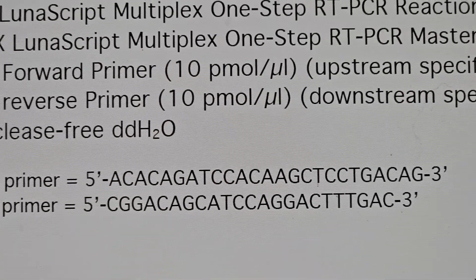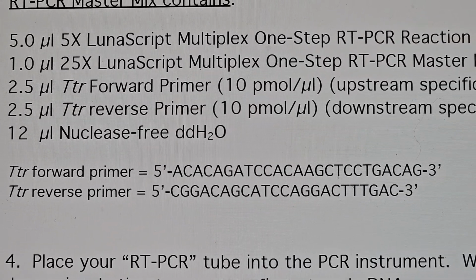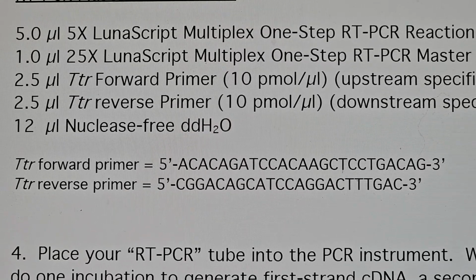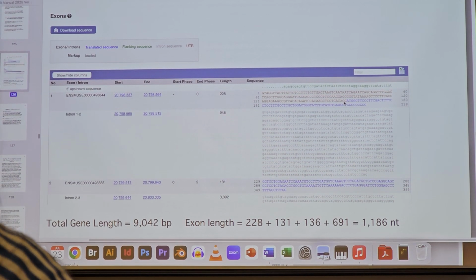Okay. So we did PCR with the forward and reverse. I'm not going to look for the reverse down there, but it's in the middle of the second exon. The forward primer we also use for sequencing, so primer to sequence through our PCR product.